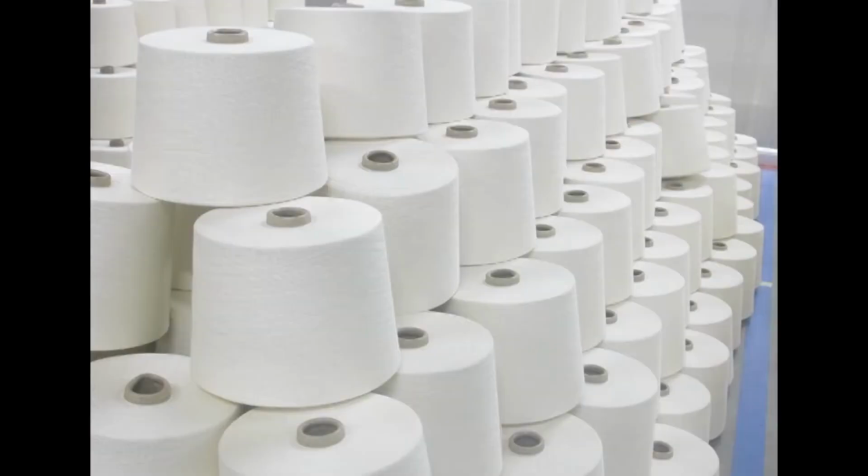Today we will be discussing yarn testing and the importance of the different yarns, their structure, their characteristics, and how we have to measure the fineness of the yarns, and how the twist and the crimp that is present in the yarns can also be tested, apart from what is the importance of all these elements in a yarn.